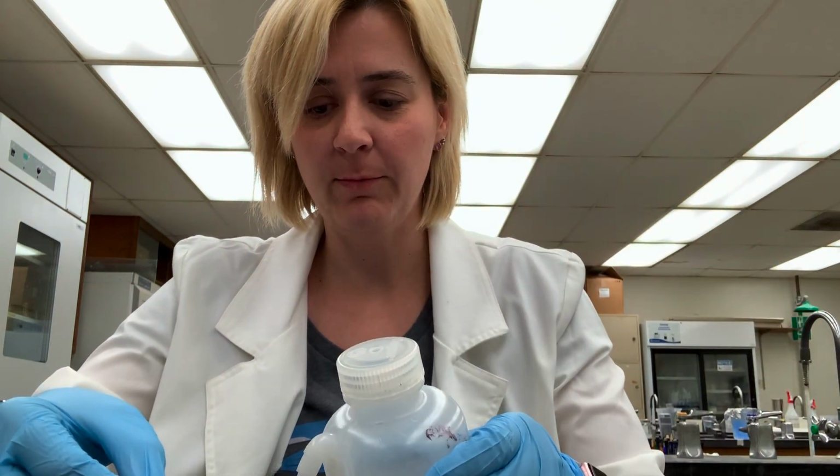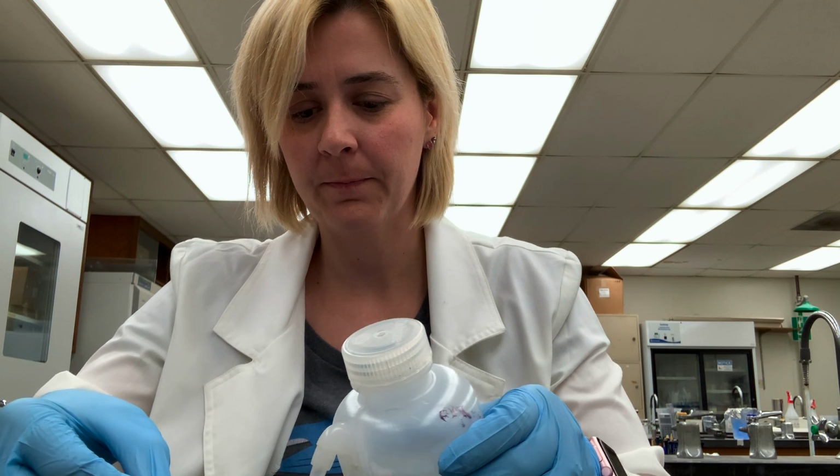Okay, so it's been about a minute. We'll go ahead and rinse off our iodine just like we've done before using water.